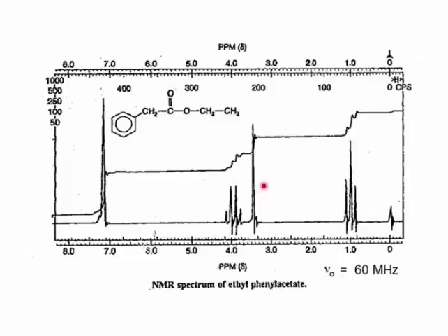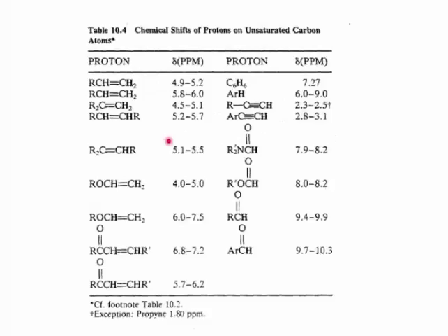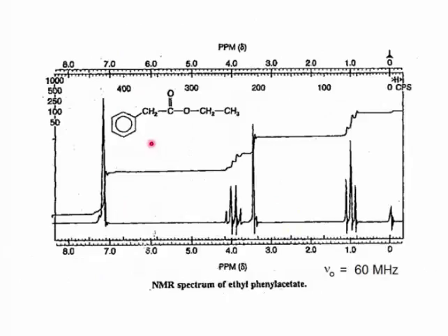Well, let's go on. Right, the remaining methylene. Now this one's going to be a little bit harder to estimate the chemical shift because it's attached to two substituents, two electron withdrawing substituents. If we go to the tables, we won't see a precise entry, an entry that is precisely that situation. So we're going to try to make some estimates, and here's what we'll do. Our molecule has two substituents, a benzene ring and an ester carbonyl group.